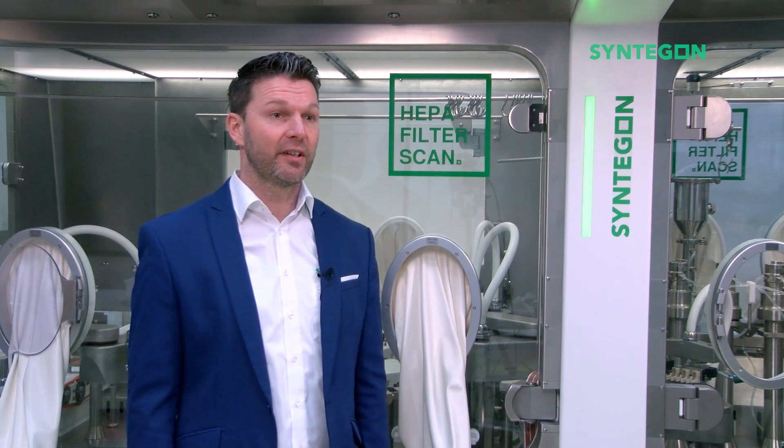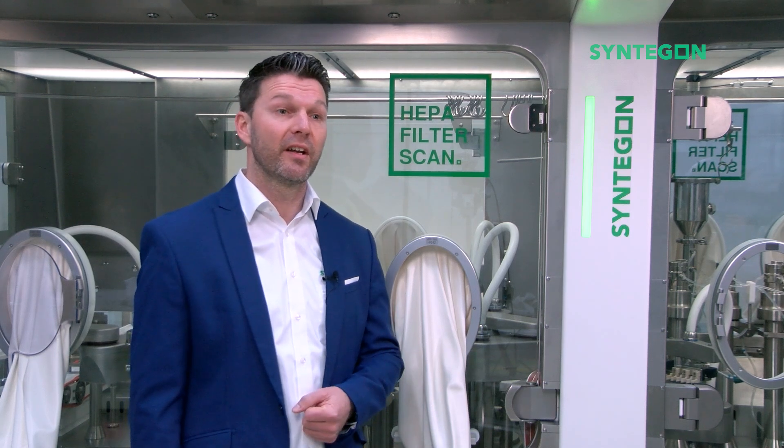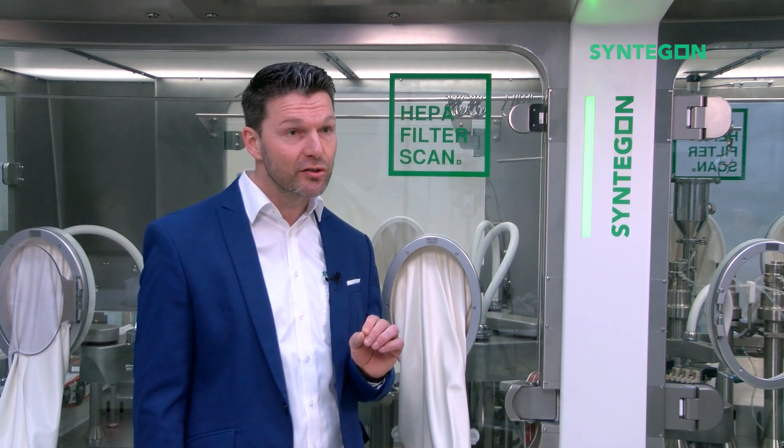Our Glove Integrity Testers follow the working principle of pressure decay and have been in use for more than 10 years already, steadily updated with technological evolution over time.